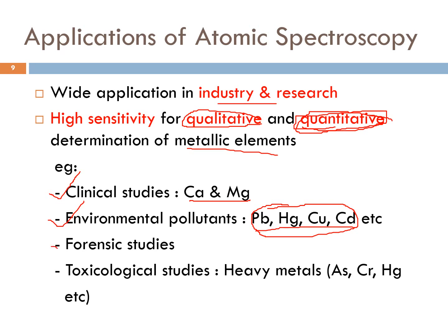Okay, then for forensic study, let's say you want to determine the presence or the concentration of metal in your hair. So macam forensik lah, you boleh tahu kalau dekat rambut orang tu ada lead ke, ada copper ke, you boleh tahu dia sebelum kejadian tu dia pergi kat mana ke, something like that lah, untuk forensic study.